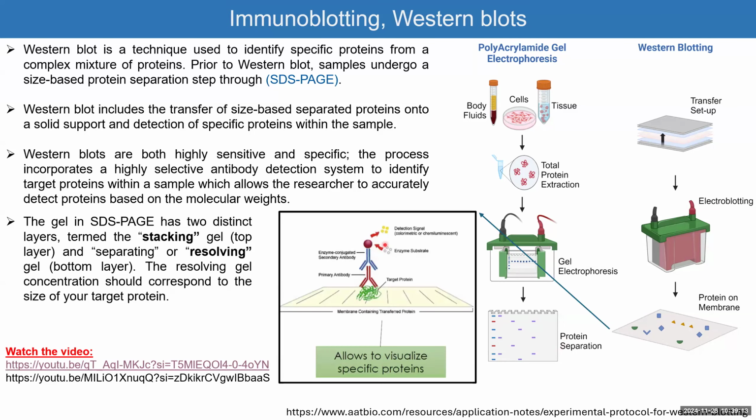So at this point, we have our protein of interest somewhere on the membrane. Again, many times before doing the experiment, we should have an idea about what we are doing. So if I'm working on a protein, let's say it's periostin, I should know the molecular weight of the periostin, or the SMAD2 and SMAD3 that you saw in the assignment.